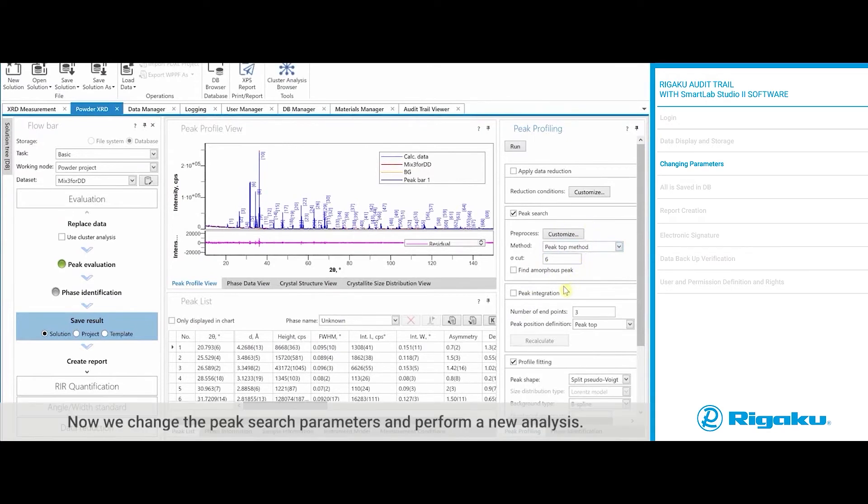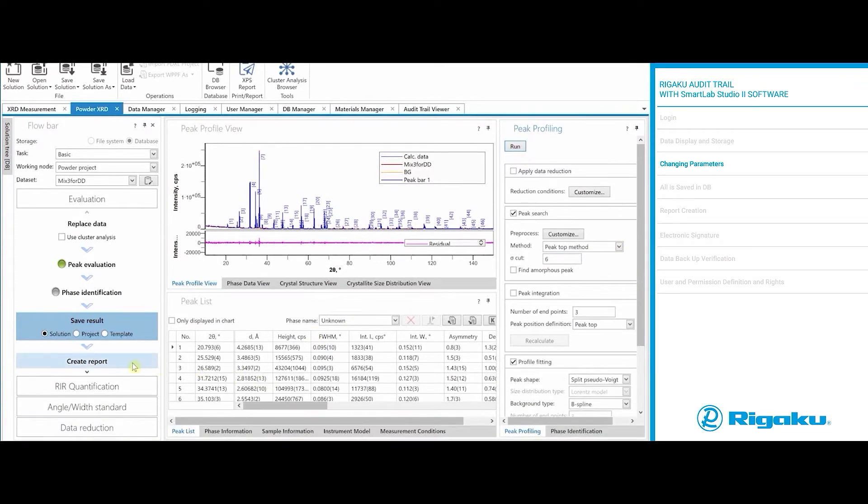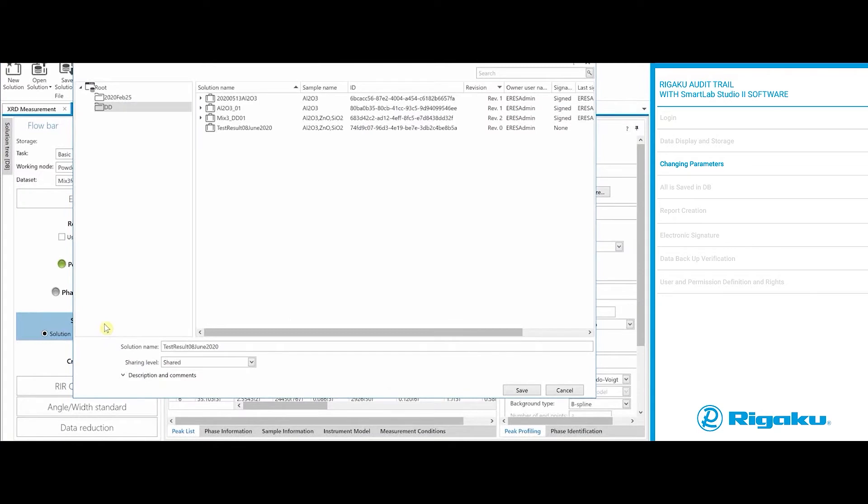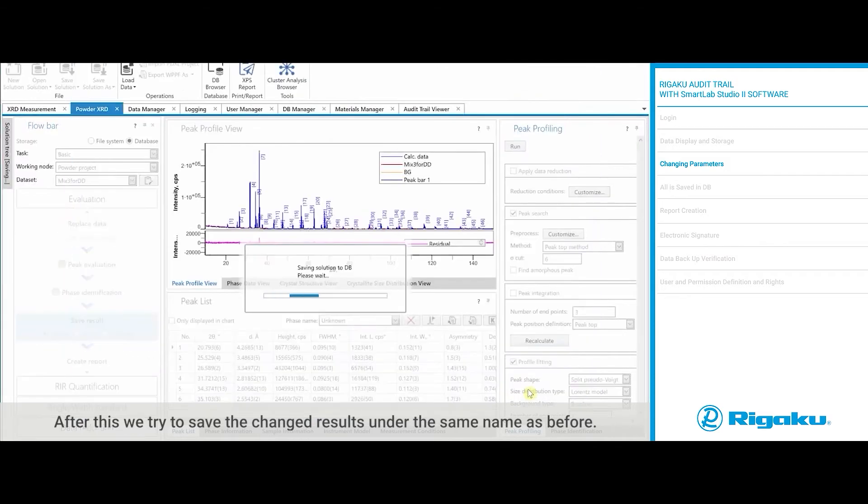Now we can change the PEAK search parameters and perform a new analysis. After this, we try to save the changed results under the same name as before.